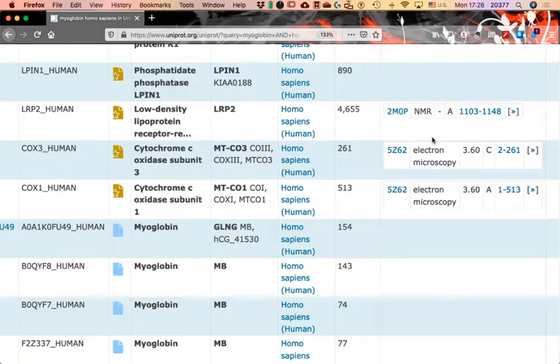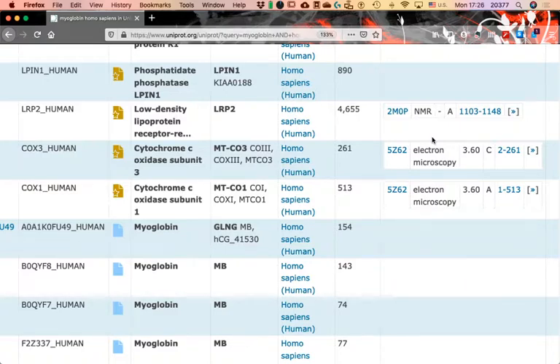Some structures have been solved by X-ray. This low-density lipoprotein receptor has only been solved by nuclear magnetic resonance, and only a tiny piece — the whole protein is over 4,000 amino acids, but the structure deposited is just 45 residues. By electron microscopy, other structures have been solved at lower resolution but with greater coverage. These EM structures are more difficult to analyze at an atomistic level, so I won't cover them in this class, but in general this methodology is better for very large proteins.